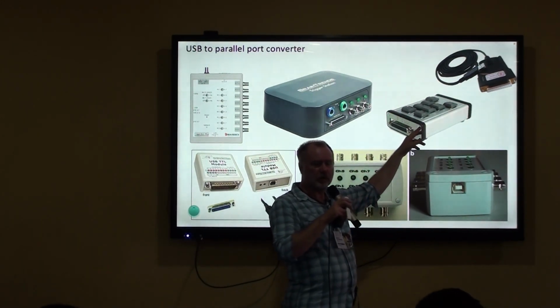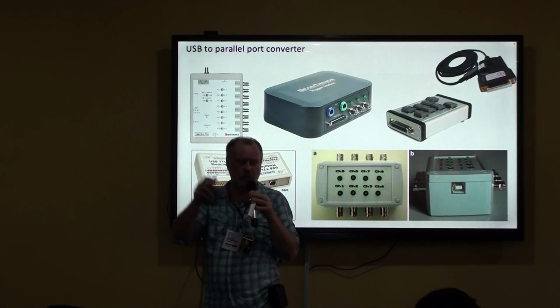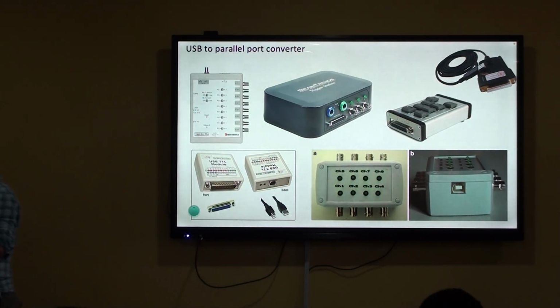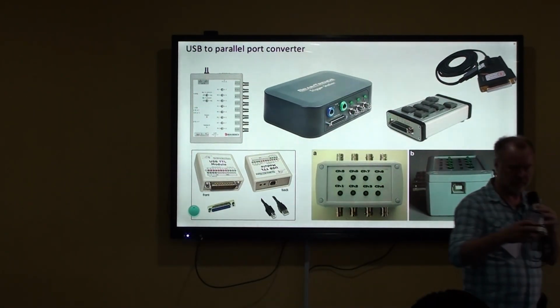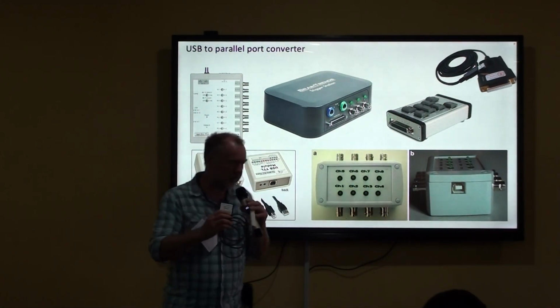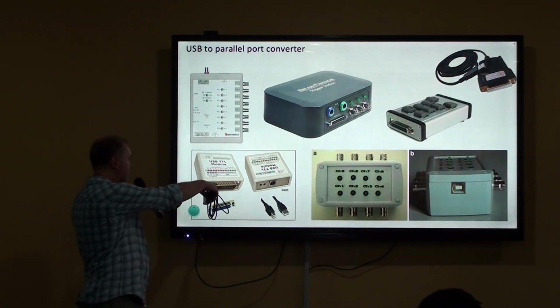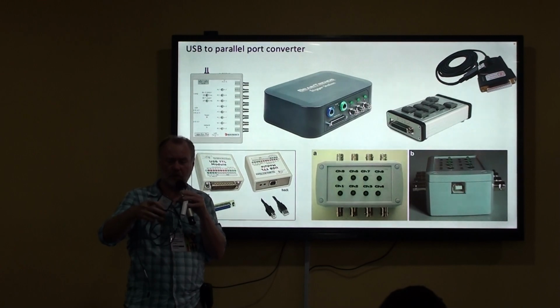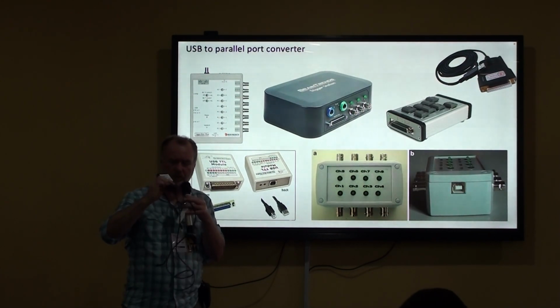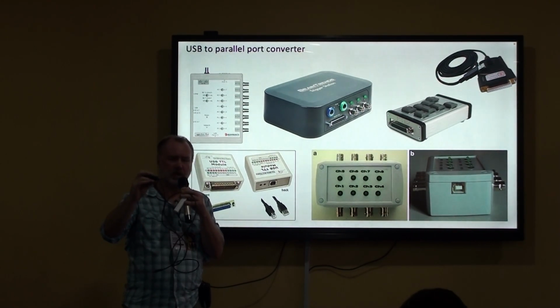So this is an old box that we used at the Donders. I just was able to take it with me. So this is another box. It's a version of this one. On one side it has a USB connector, and on the other side it has a cable, and this cable goes to the computer.